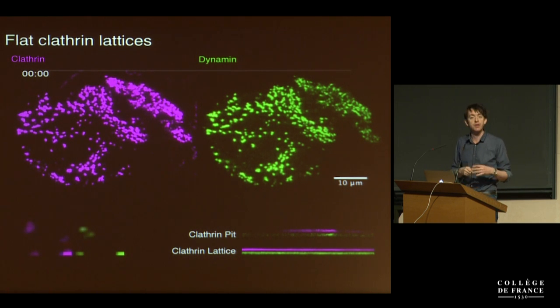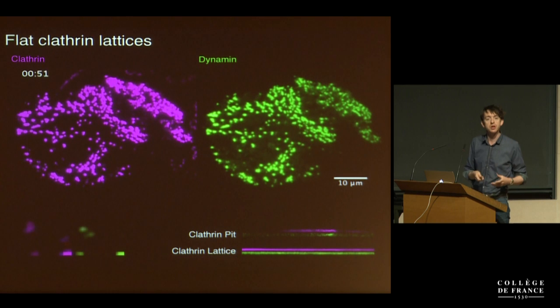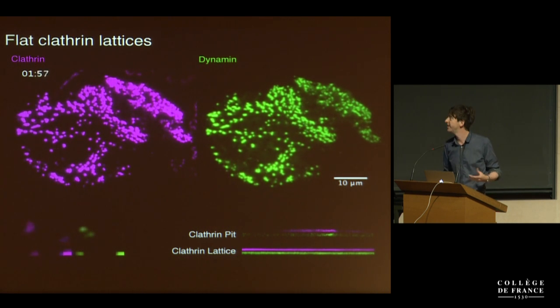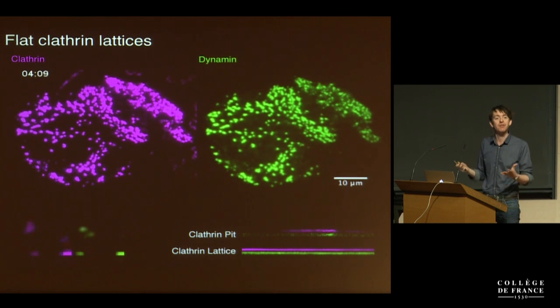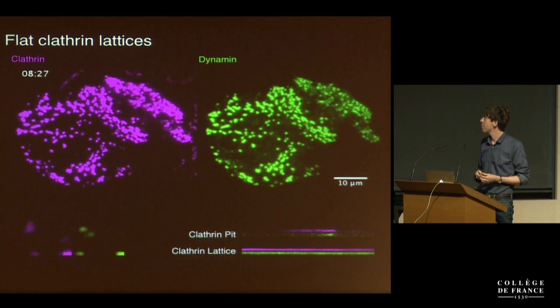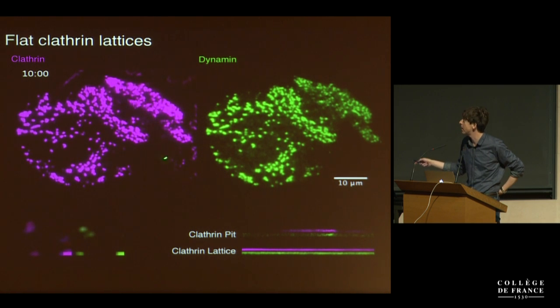We viewed this by conventional TIRF microscopy. I took a frame every 3 seconds for 10 minutes. And I'm sure you can appreciate there's very little going on. These structures just sit there. And actually, I viewed these in independent experiments for an hour or two, and they just stay there for prolonged amounts of time.